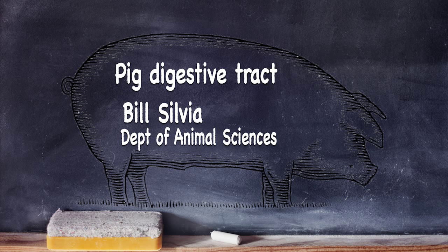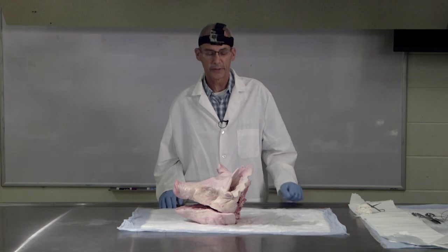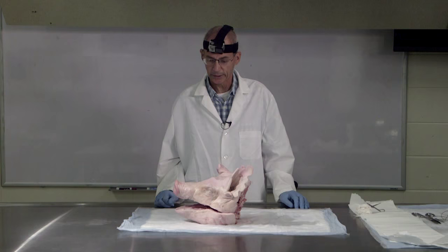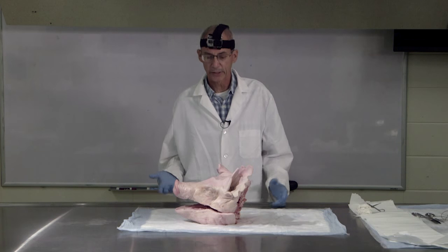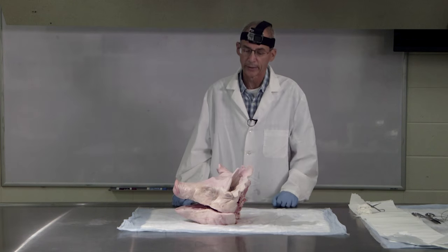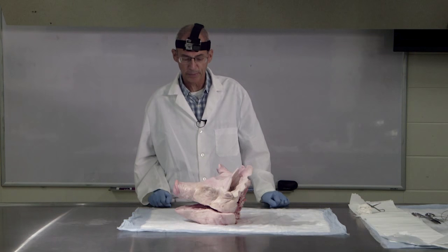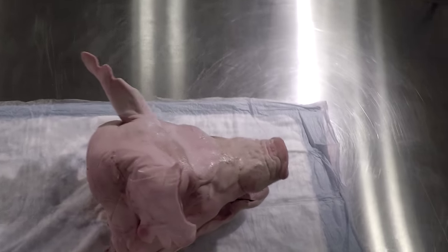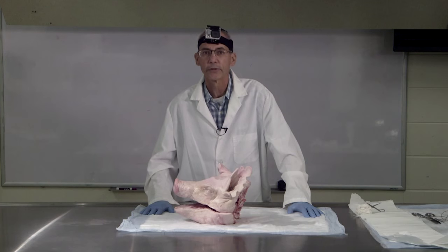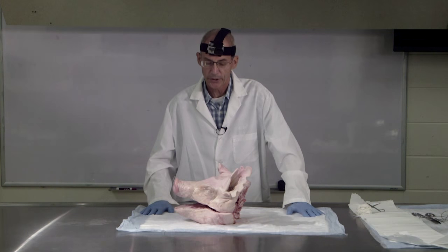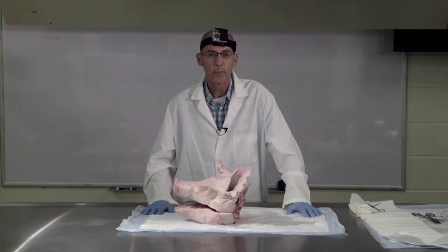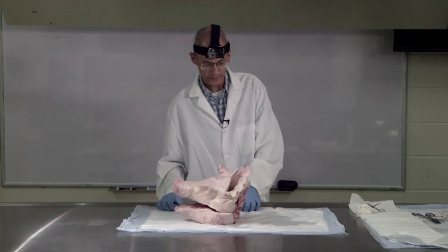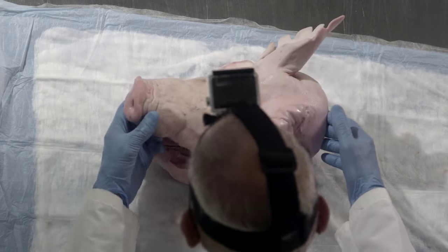In this session, we're going to examine the digestive tract of a pig. We're going to begin with the mouth. It's a part of the digestive tract that people tend to ignore, but it's a very important one. It's the gateway to the digestive tract, and there actually is some digestive activity that goes on in the mouth, and we'll see how both of those occur.